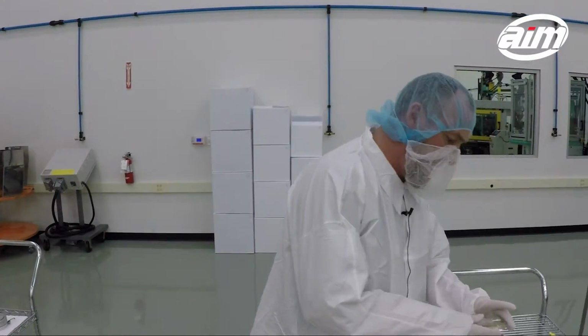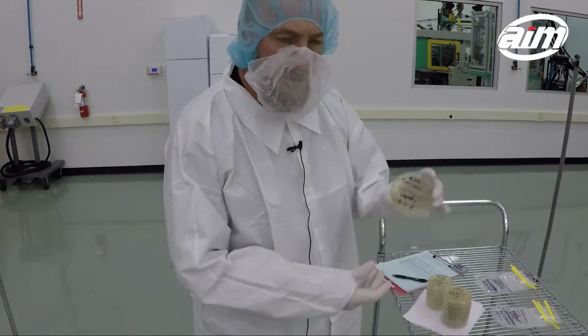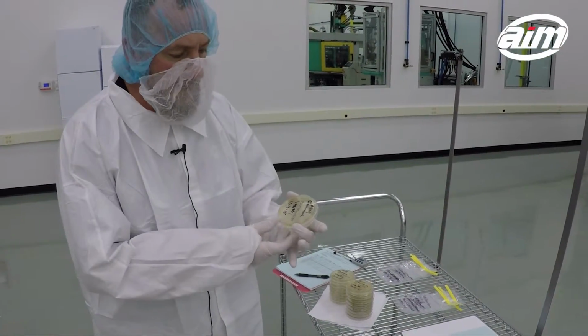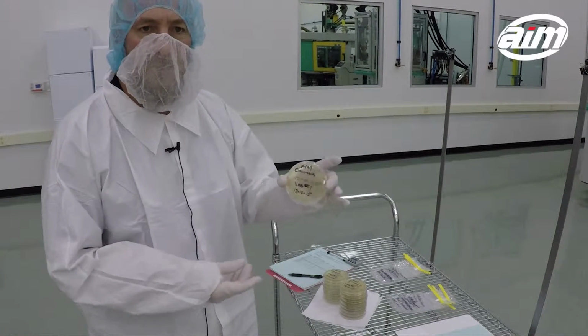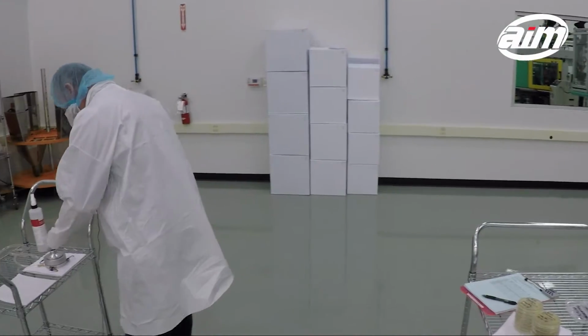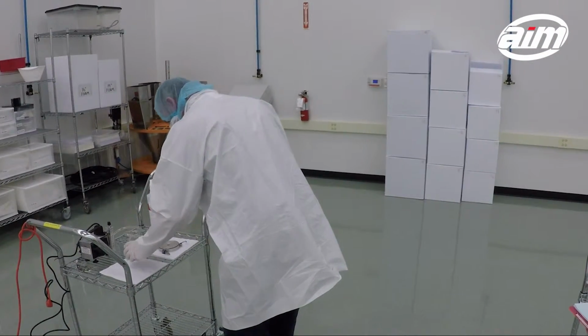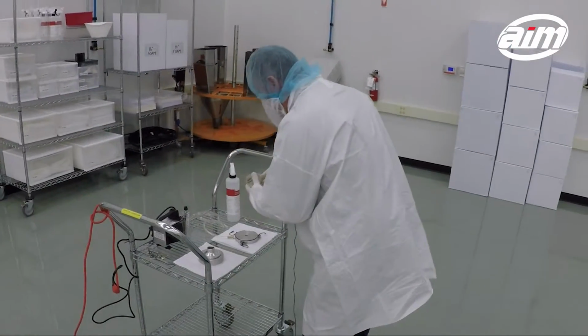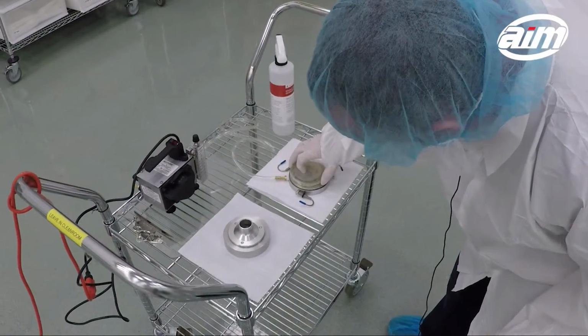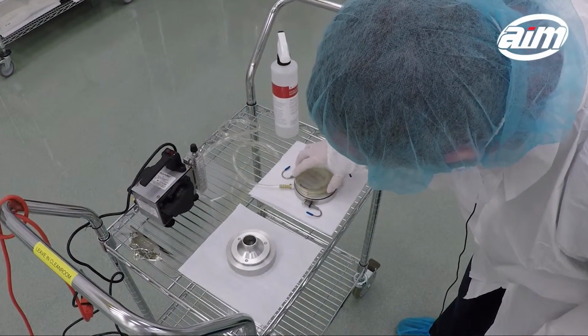I'll take a sample plate with the sample medium on it, and this is for the bacterial counts. Place the plate down onto the impactor base.